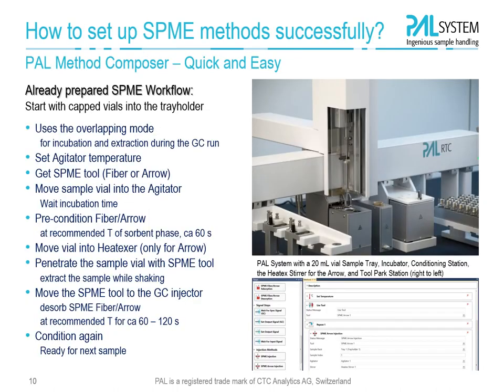How to set up SPME methods on the PAL system? This is fairly easy. The PAL method composer allows us a quick and easy setup of any kind of workflow. We see the method composer here on the bottom right. It is used to pull the desired activities as a sequence into the center of the screen. The default parameters can then be adjusted as necessary.